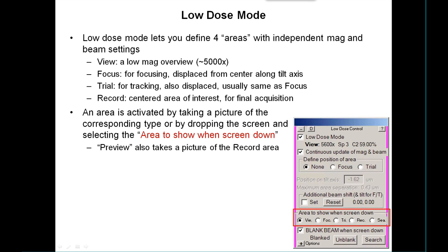To activate or go to one of these areas, the simple way is just to take a picture of that corresponding camera type. The other way is to drop the screen and use the area shown when screen is down selection, so that it goes to one of the areas. That's particularly useful for adjusting the low dose in the first place.